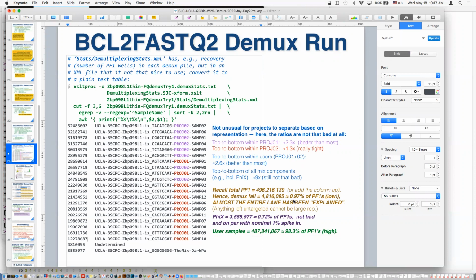That's pretty good. 99% of the wells in the lane that aren't empty, right? Obviously those are dead. But 99% of the wells that got filled, we put in a file that isn't Demux. So that sounds pretty good. And there can't be anything big left, right? There's not anything to discover really left in this lane.